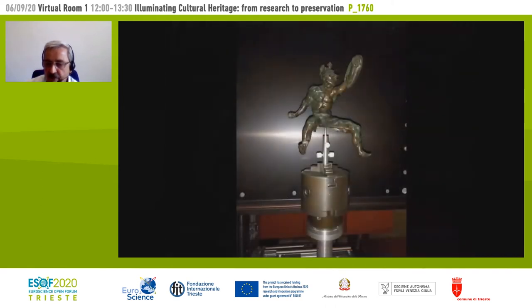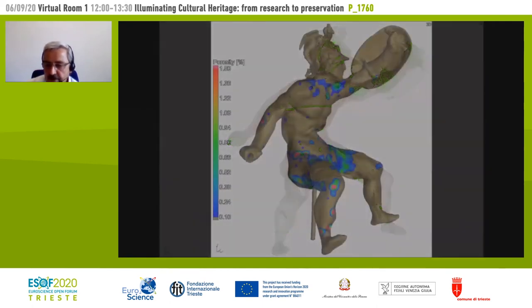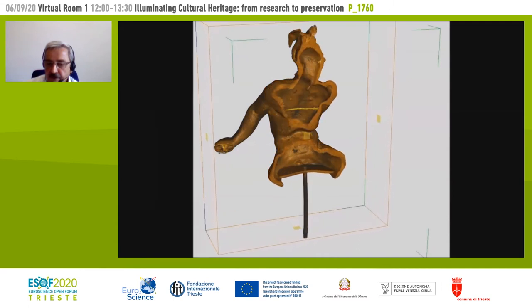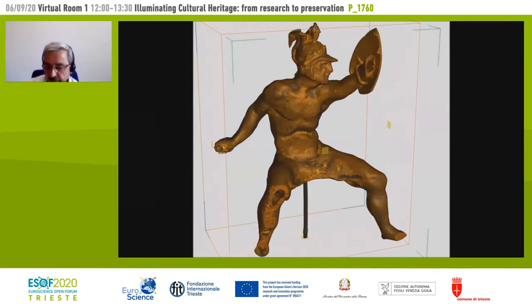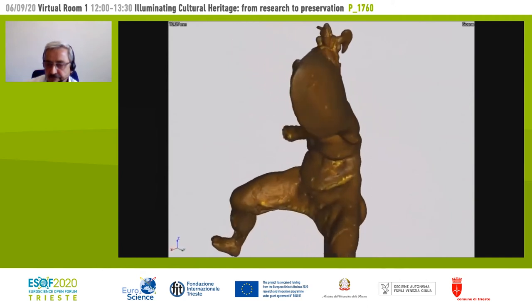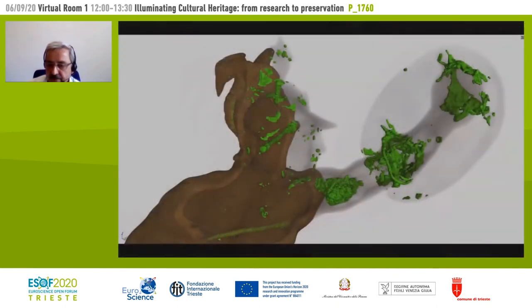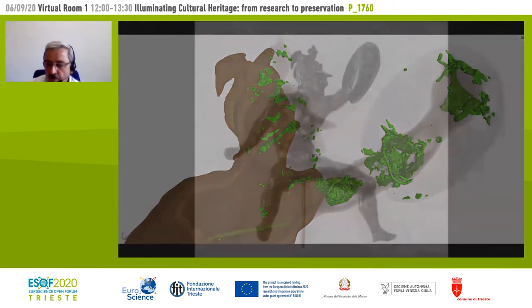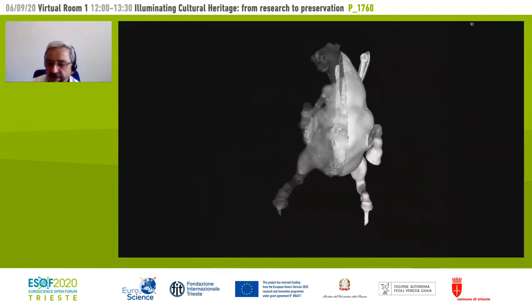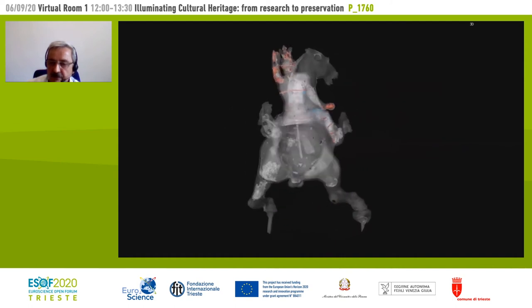Now this is again the statue of the horse. You can see the rider of the horse and also the remnants inside the statue. The porosity in percentage, the largest was 1%. Then again, the photograph. Parts where no bronze was found in the rider. This is another interesting view of the head remnants and various parts which don't belong to bronze.